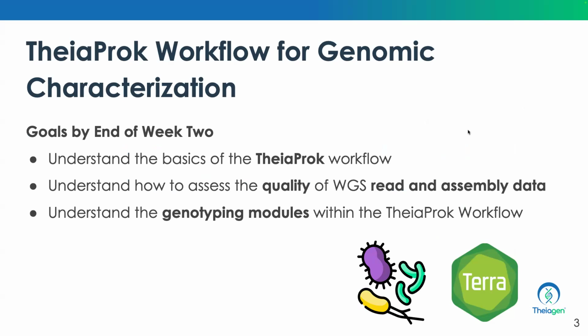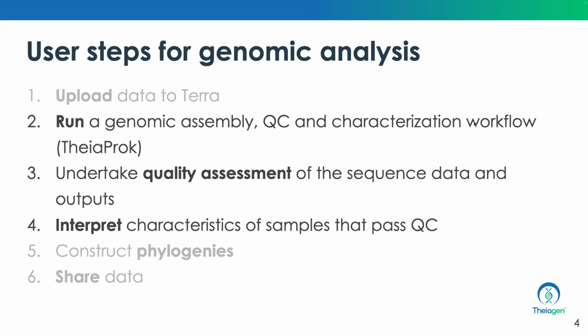The hope is that by, let's say, Thursday, please ensure that you're able to run TheiaProk on your workspace, because we'll be looking at the results that we get from that analysis.